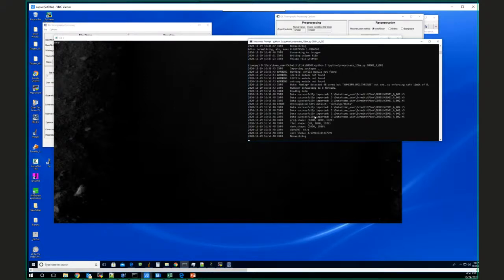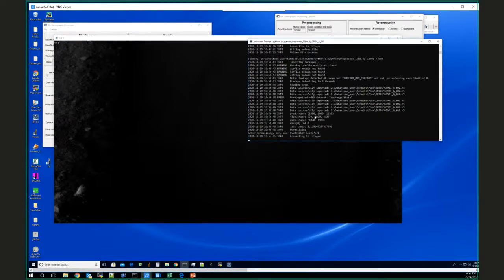Right. Well, there could be a lot of junk, it impacted into thick carbonate sequences. Yeah, and so there would be some calcium around there probably too. For that, you probably should make a thin section and put it on the electron microprobe, or an XRF machine, and measure. No, I think we'll have to do that. Yeah, or Chris will have to do that.